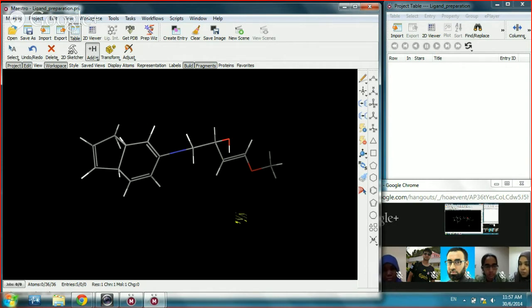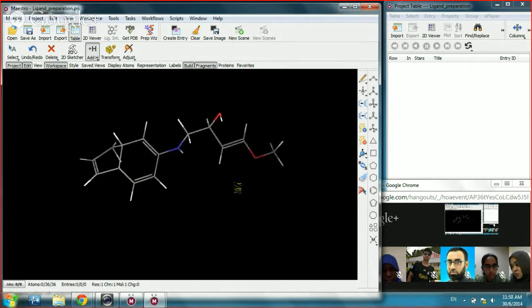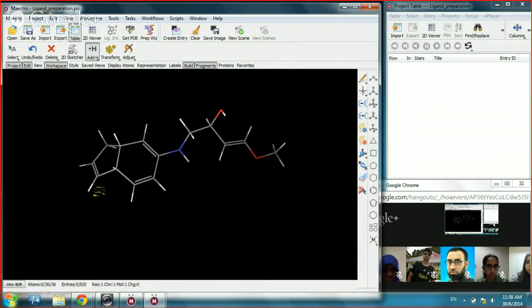So after drawing the molecule, say for example our molecular drawing is over, you can see when you draw the molecule and add the substituent, it may happen that the position of atoms, the angle, the order is not assigned properly. So after drawing any molecule, you need to go and clean up the structure. Here you can see the icon clean up geometry, icons with bubbles, right? You just click that. You see the effect in the molecule. Can you see they're changing their geometry, dancing, the molecules, right?